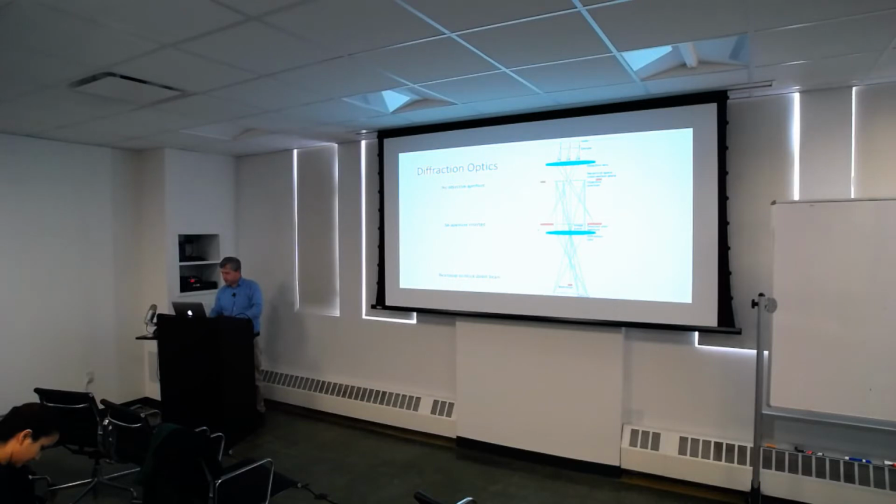Instead of having the projection lens turned on, the lenses are set so that they basically become diffraction lenses, so that instead of an image forming at your detector plane, you end up getting a diffraction pattern formed, and you collect the diffraction spots on your detector. You also then have to have a beam stop inserted. That's just that little pointer, which is on all scopes. You center it so that the pointer blocks out the unscattered beam. Otherwise, you'll burn through your detector very quickly. So this is the setup for diffraction imaging.